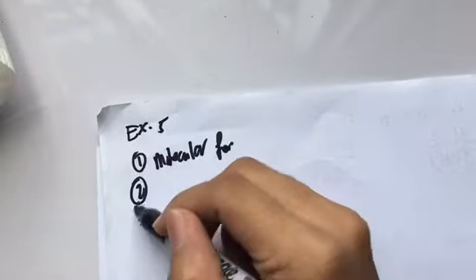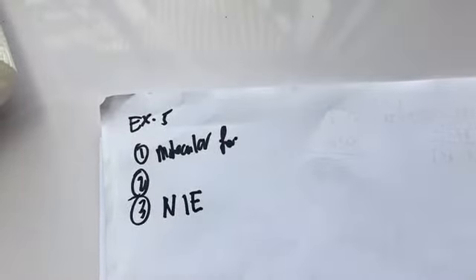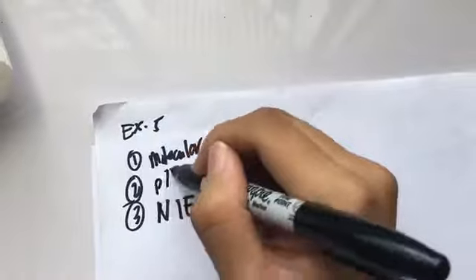The second one is to identify its pH using a pH indicator as well as a pH meter. And then the third one is to explain the chemical behavior of salt in water and then identify its net ionic equation involved in the hydrolysis.